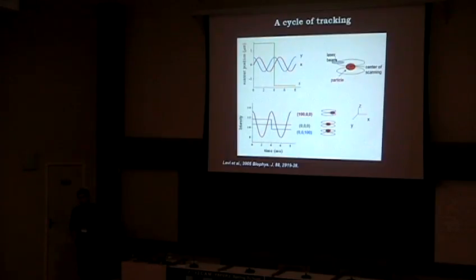And this is actually quite nice because the major technique used for tracking fluorescent particles is using a very fast CCD camera and taking a sequence of images of the particle moving. Then you determine the centroid, or exactly the center of the fluorescent spot, and you follow that spot, so you determine the trajectory. But this is limited to a plane, to 2D. You cannot do 3D. And as we know, cells are intrinsically 3D systems. They are not planar, and particles move all around. They are not moving only in one plane. So once the particles go out of the plane, you lose them, and you have to start all over again. With this system, we can follow in 3D, in real time.